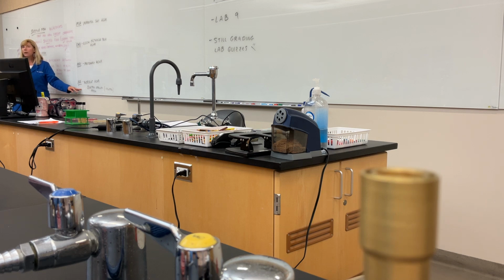And I'll give you this little heads up. When we work with blood agar, it is not from slaughtered sheep. It is actually from sheep that are so pampered you wouldn't believe it. They're raised in Montana. They have a ranch and they circulate the sheep. They have different colored collars and they come in once a month to give a blood donation, kind of like how humans give a blood donation, and then they're re-released back out into the fields.